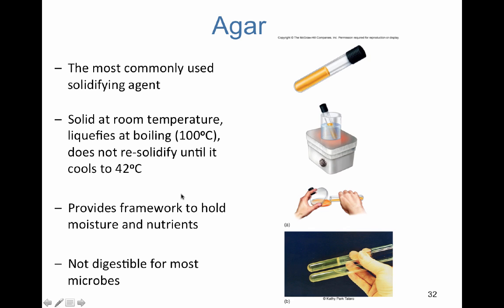Another ideal characteristic of agar here is that it provides a framework to hold moisture for the microbes and also nutrients.